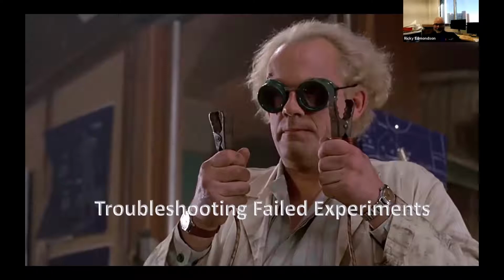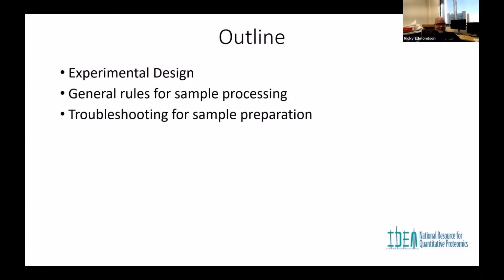The electrospray source on the mass spectrometer runs at somewhere between 2,000 and 2,500 volts, and I shock myself with it once a week. But it's mostly a static shock, so it's not too bad. This looks maybe a little more dangerous.